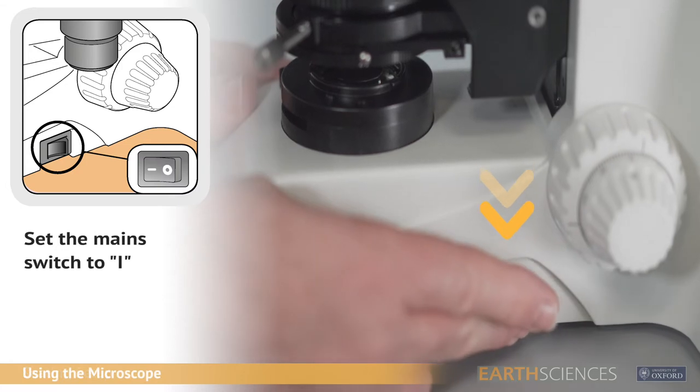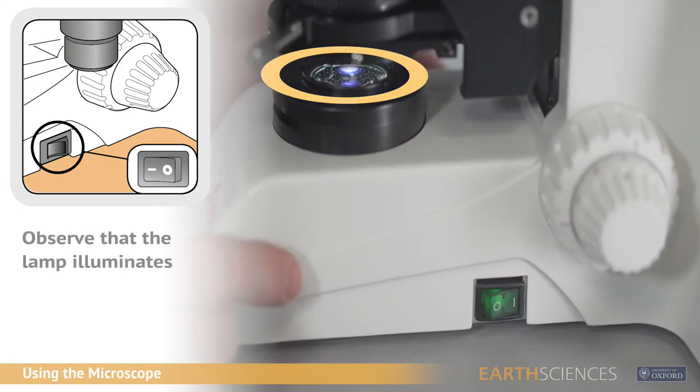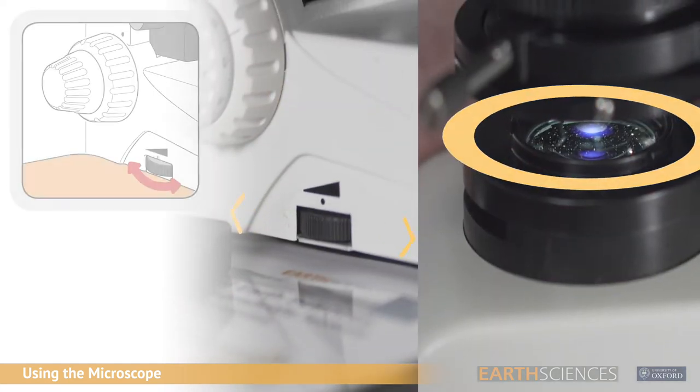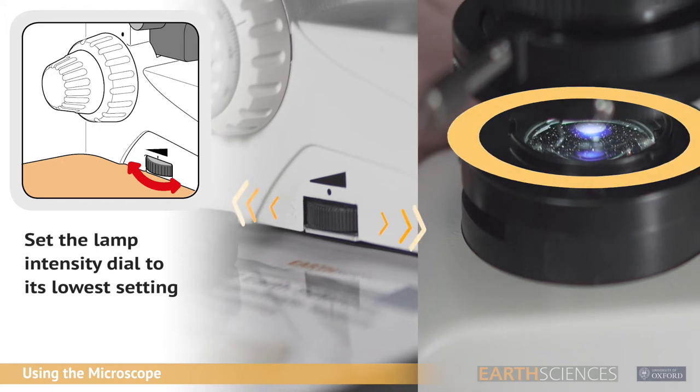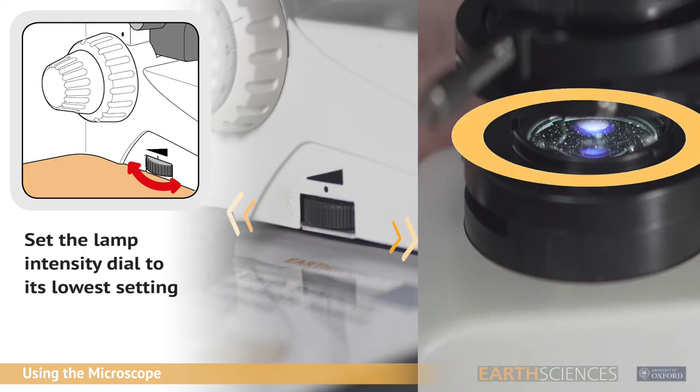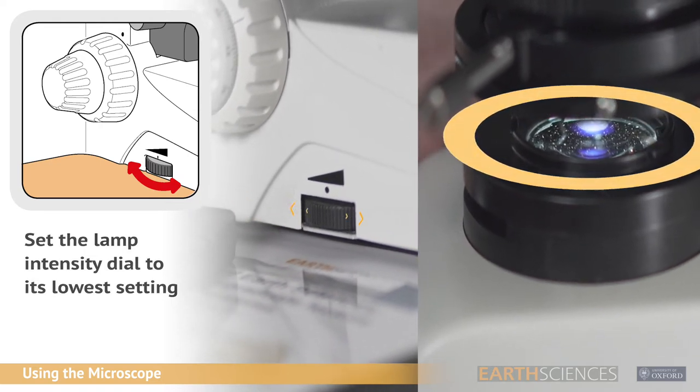On the right hand side of the base is the mains switch. Zero is off, one is on and will be illuminated. On the left hand side is the lamp intensity dial. It's good practice to leave the dial rotated to the lowest light intensity to protect the user's eyes before viewing.